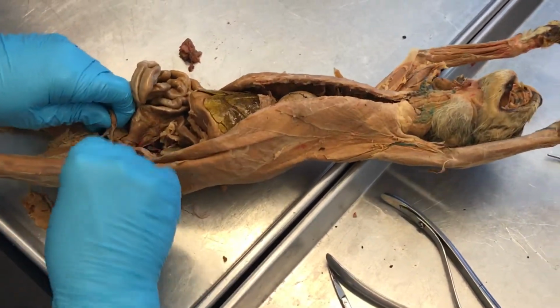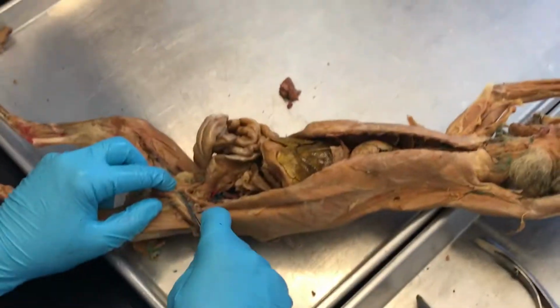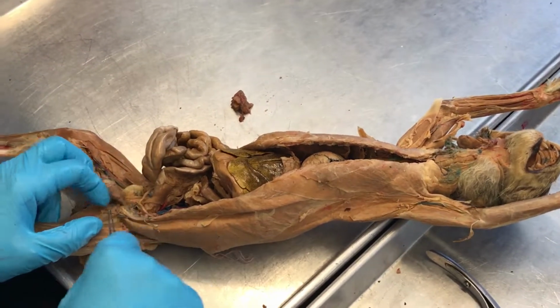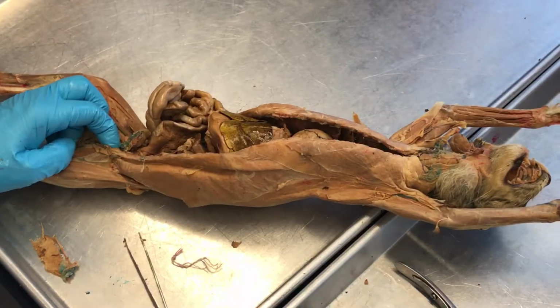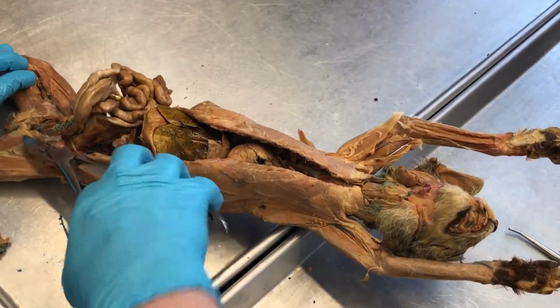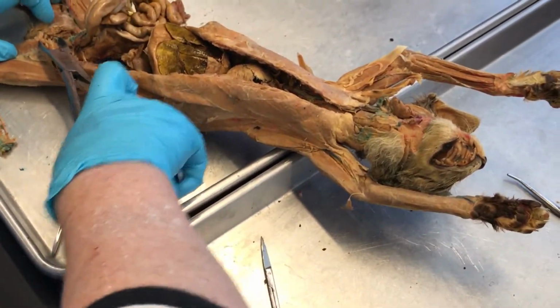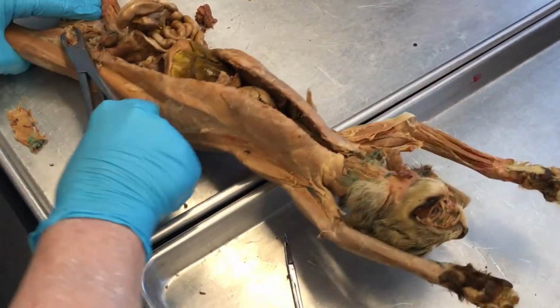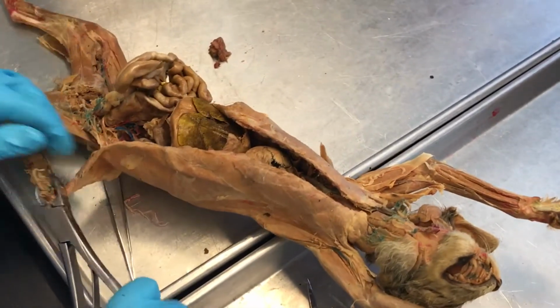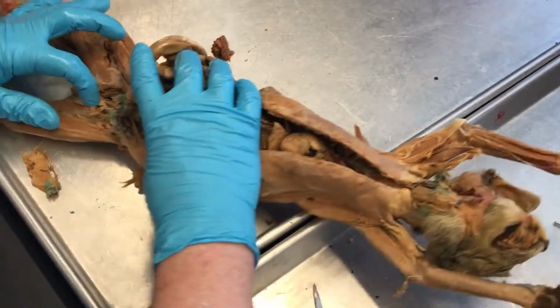Okay, let's look behind now. We'd sort of already seen that on the male, but on the female, next we have the uterus, and we want to go behind the urethra to see the vagina. Open this up a little bit by cutting a little more. I can see a little better in here.